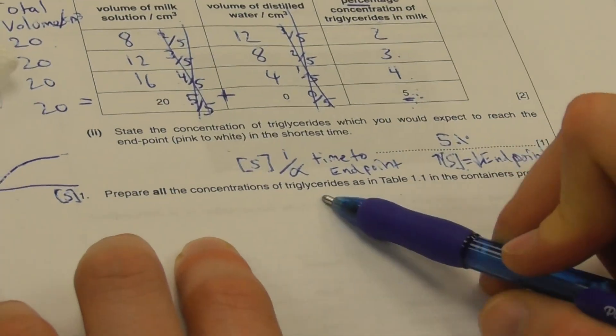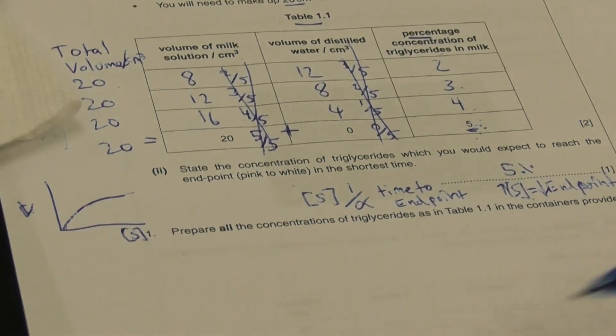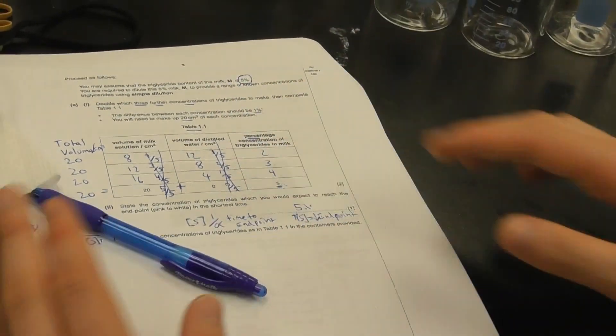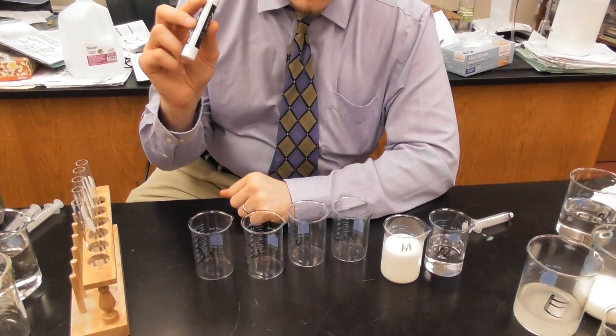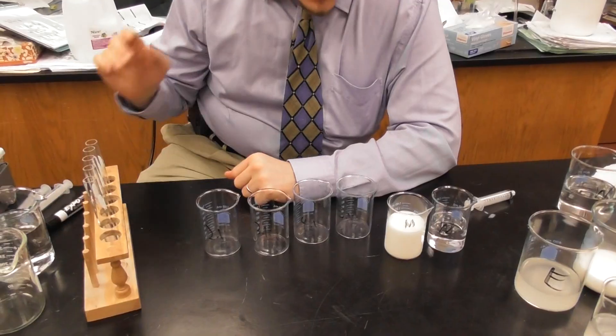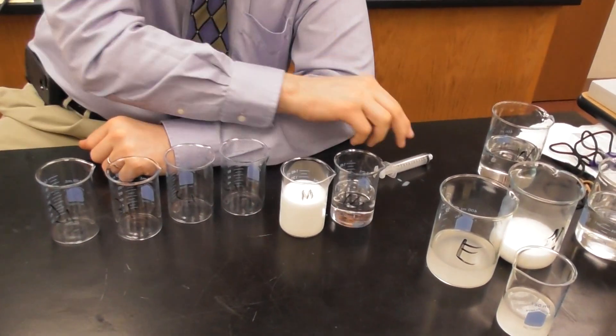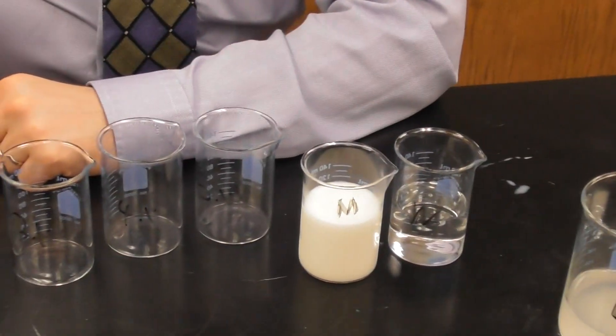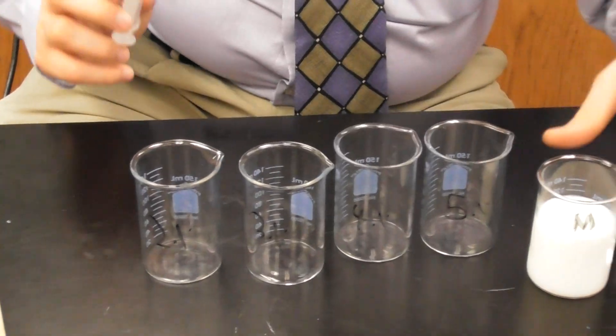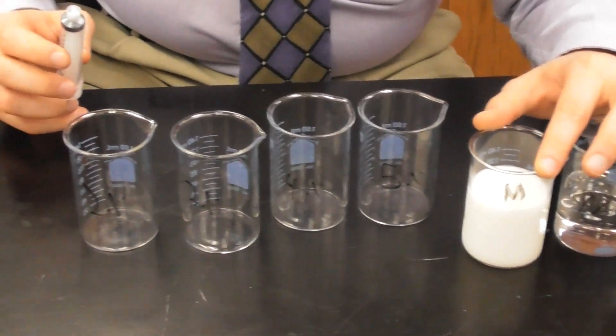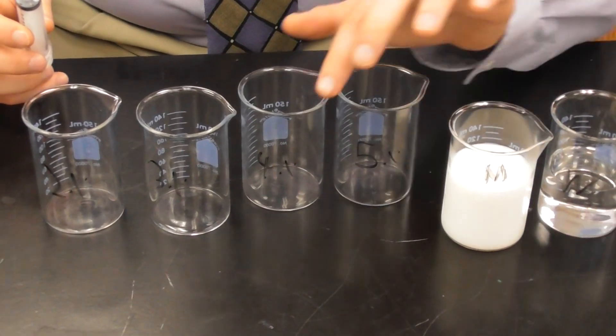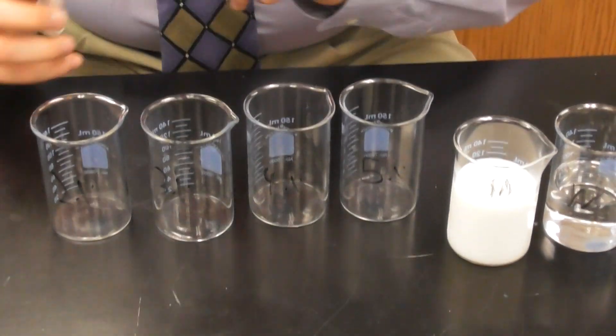Our step one of our reaction is to prepare the concentration of triglycerides in table 1.1 in the containers provided. So we're going to scroll over here and I'm going to perform this simple dilution right now. Using my marker, my glass marking pen, I have pre-labeled all of these beakers and I am going to perform my serial dilution now.